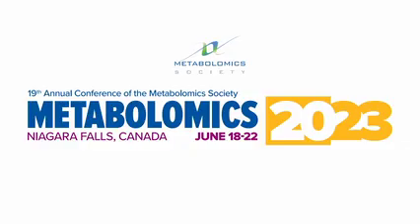Okay, so in the last few minutes, I have some slides to show you about CCS prediction and places for finding CCS values. A nice summary, wrapping up the final part of your experiment, where you've got to start working on those identifications and figuring out what you've found.